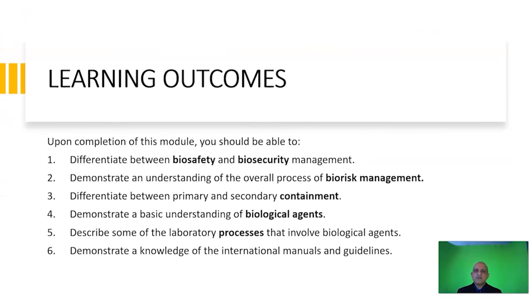These are your learning outcomes for this particular lecture module. The first one is you should be able to differentiate between biosafety and biosecurity in terms of the definitions. The second one is to demonstrate an understanding of the overall process of biorisk management. What is biorisk management and what does it involve? The third one is the principle of containment. The fourth is the biological agents. The fifth is the laboratory processes that involve biological agents. And the sixth is to demonstrate a knowledge of the international manuals and guidelines.